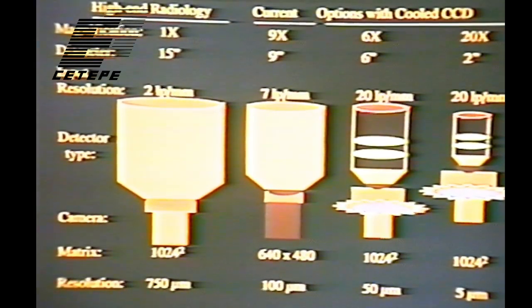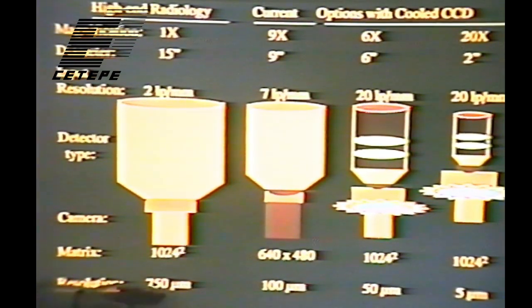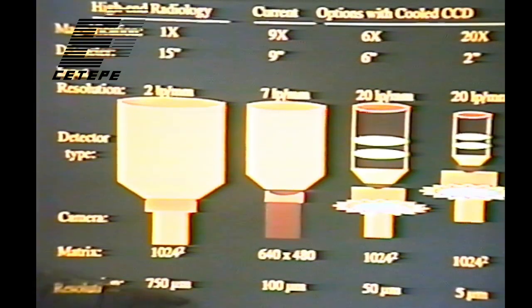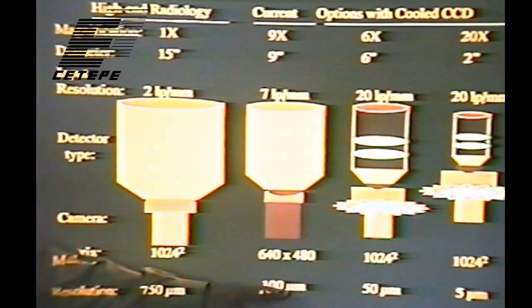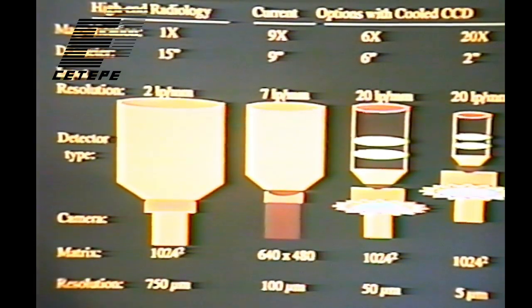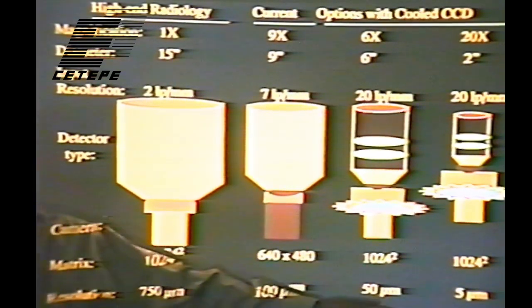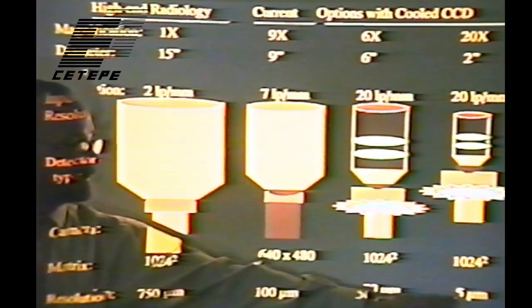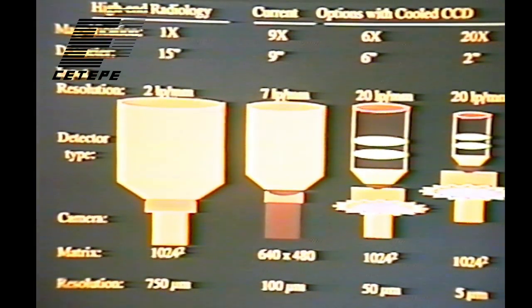Roughly, the spatial resolution in the clinic is just a little better than a millimeter. If you do everything right with this kind of setup, you might get 100 micron spatial resolution, which is the ballpark that I'm still in. And if you really built the detectors you'd like, especially for very small specimens, you might be able to get down to less than 10 microns.